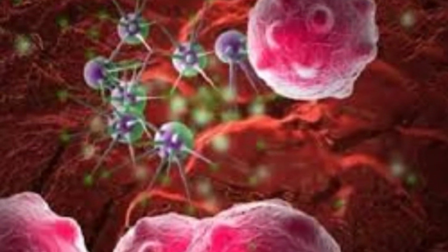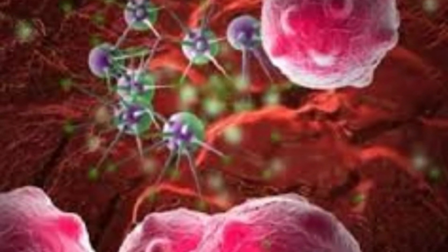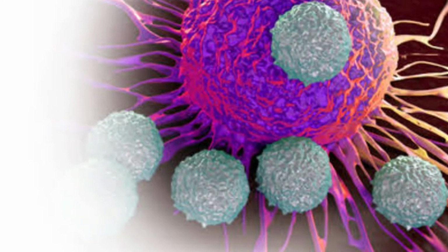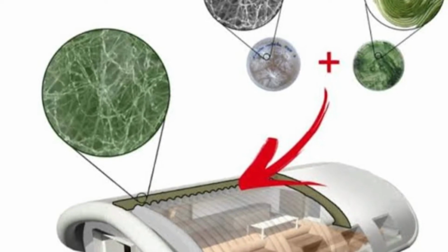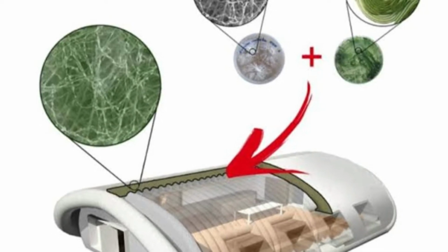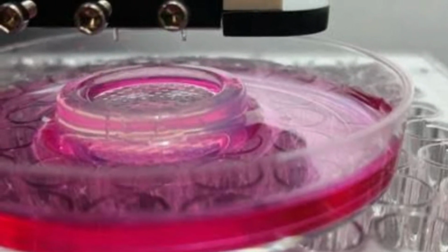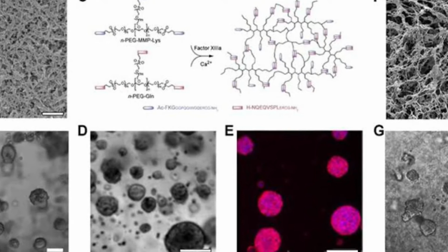a major limitation, said Ibrahim Ozbolat, Hartz Family Career Development Associate Professor of Engineering Science and Mechanics. In addition, these spheroids have been primarily bioprinted in a scaffold-free manner and could not be applied for fabrication with a scaffold. Using scaffolding is necessary for many applications in regenerative medicine and tissue engineering, and also in fabrication of microphysiological systems for disease modeling or drug screening. Ozbolat and his team used aspiration-assisted bioprinting along with conventional microvalve printing to create homogeneous tissues and tissues containing a variety of cells.